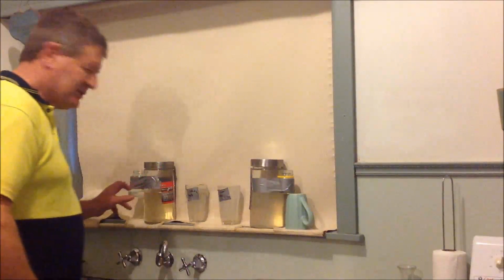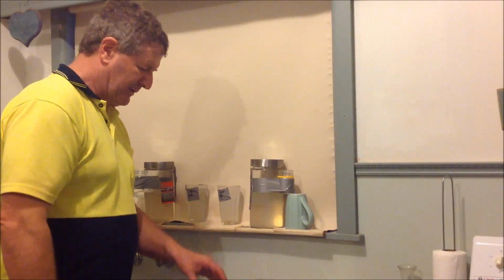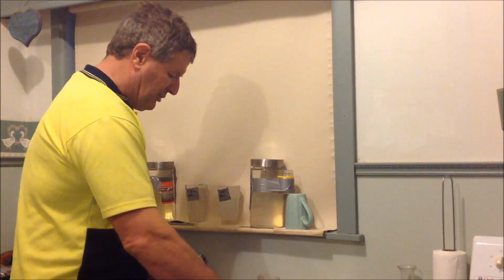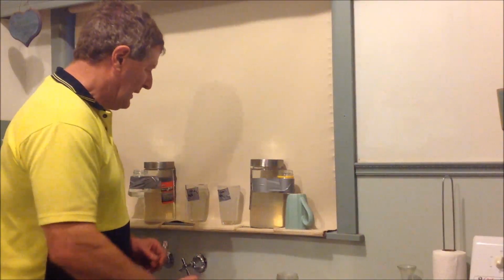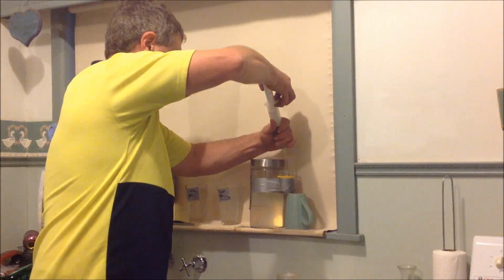Now I've pre-charged each one of these with 50 mils of water, and so I'm going to make up a 50% solution by adding 50 mils of my normal concentration of 1/3 of a gram per mil of that, which I've covered all that before. So I'll just quickly drop that in. So it's 50 mil in here.